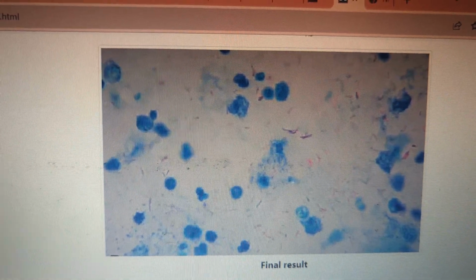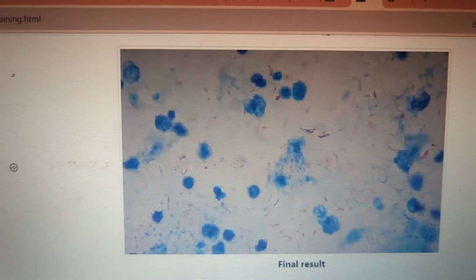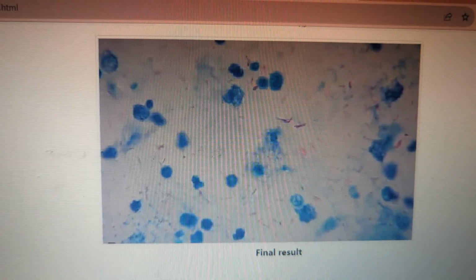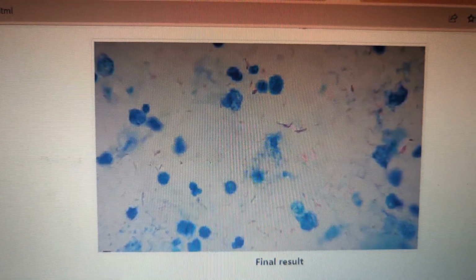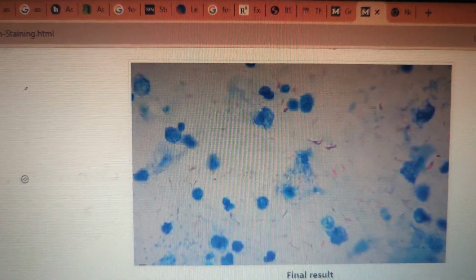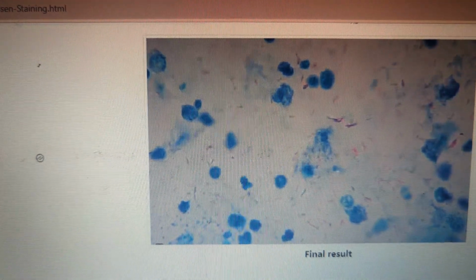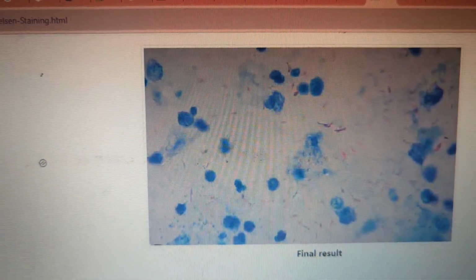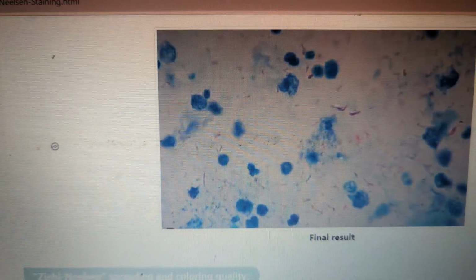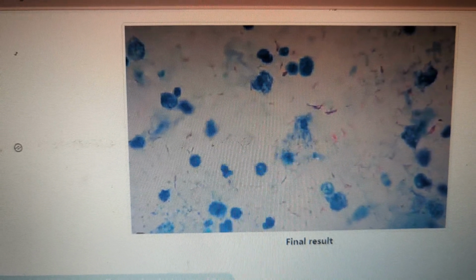So in your exercise in the lab, you have another soft copy, because I don't have a TB slide or a leprosy slide for you. But you have a soft copy, a better one than this, where you can study the bacterium in the slide and again comment on the shape, the arrangement and the color of whatever it is that you are seeing in the soft copy slide. Okay, thank you. That is all for our differential stain.